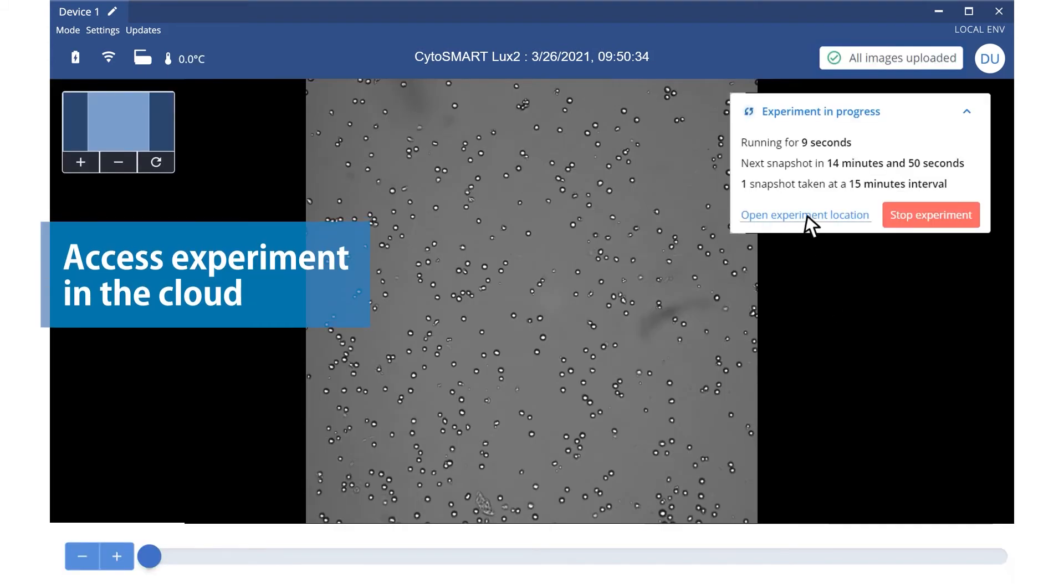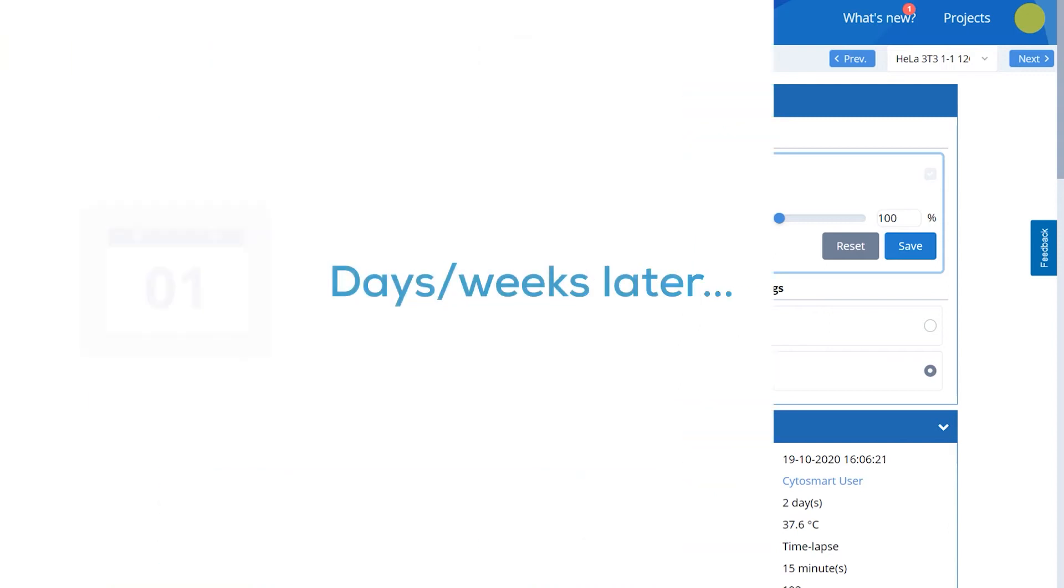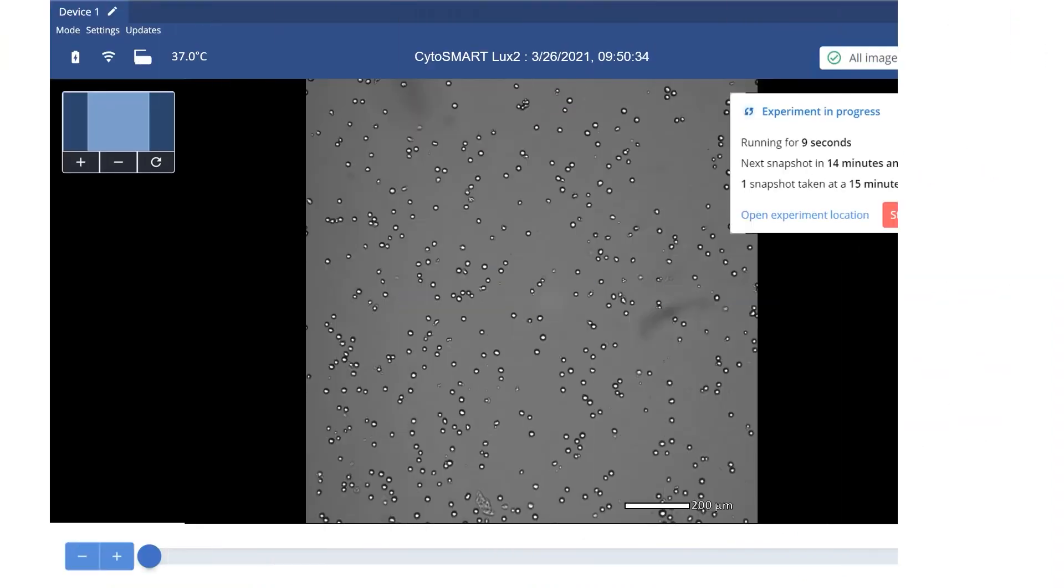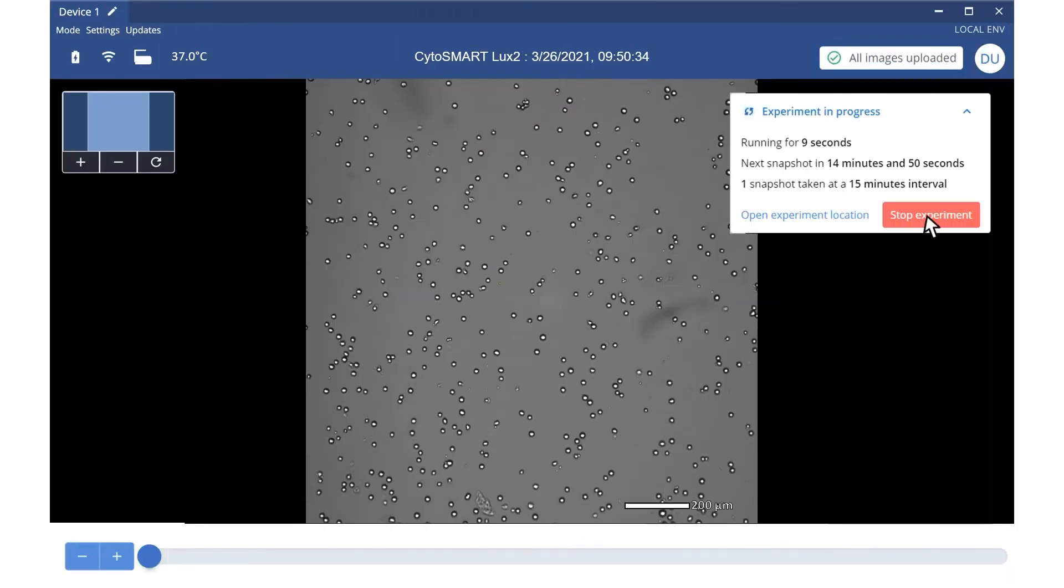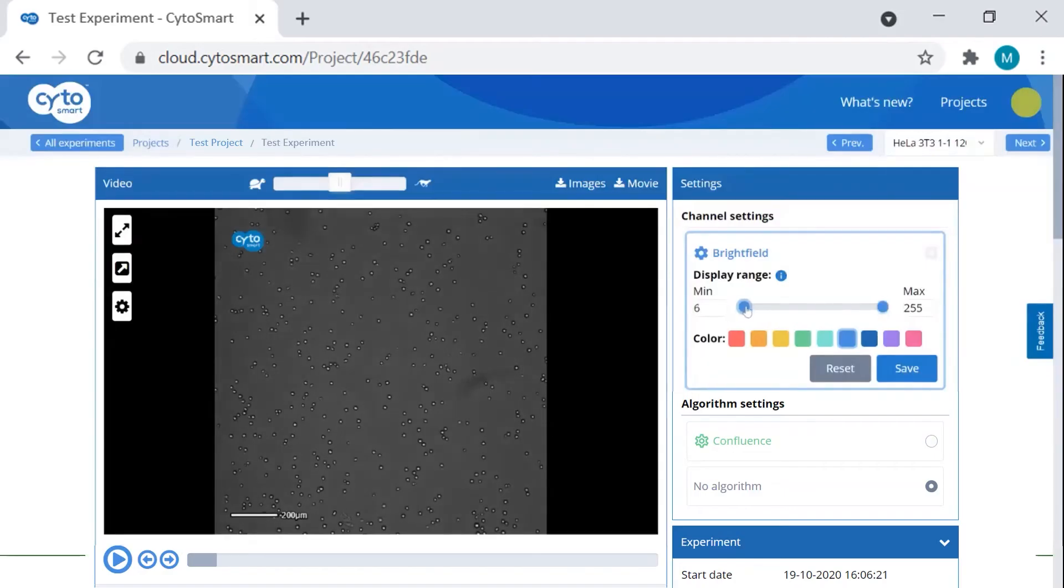With the Cytosmart Cloud, you can access your experiment anywhere. After ending your experiment, you can fine-tune the analyses and obtain optimal data from your experiment.